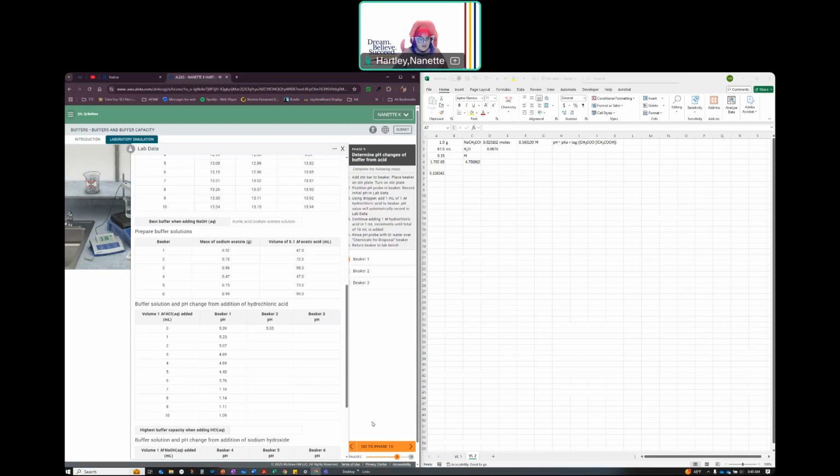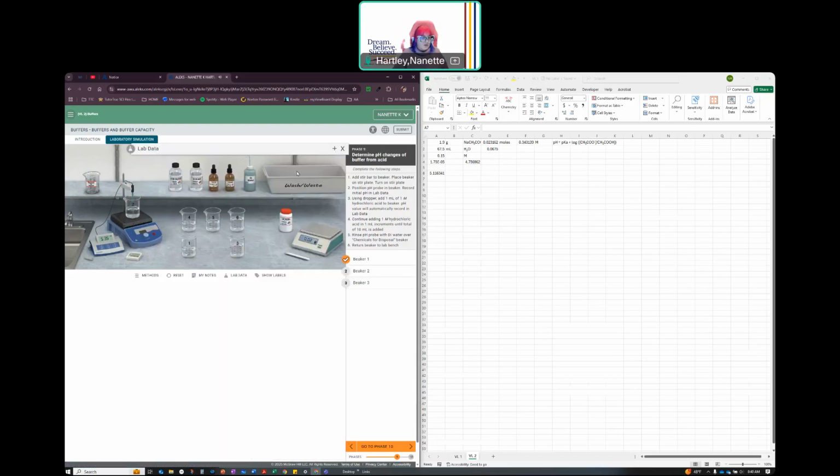And granted, it can be that quick because you can have somebody else write down everything. So I go this, and then somebody else writes down 5.24, 5.13, 5.02, 4.90, 4.76, 4.60, 4.38, 4.03, 1.20, 1.18, and they'll tell you when to stop.